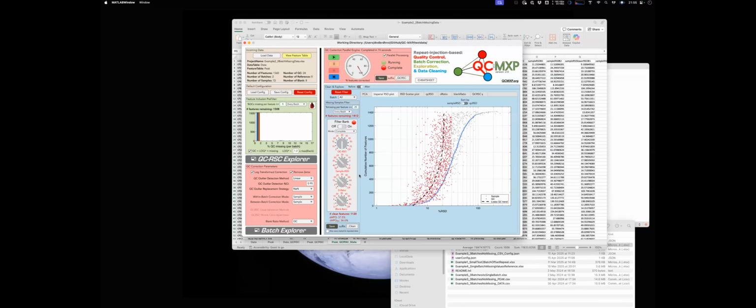Perfect. And I didn't have any problems so far, like with the program crashing or giving errors. Good. Version 2, that's good.